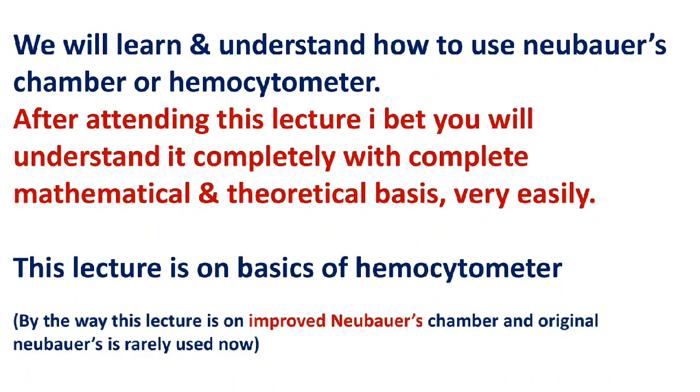You will be amazed by this traditional art of counting millions of cells in just minutes manually with this simple device and technique. Feel free to pause the video whenever you want the detailed description on the screen. In this video, basics of improved Neubauer's chamber are discussed.